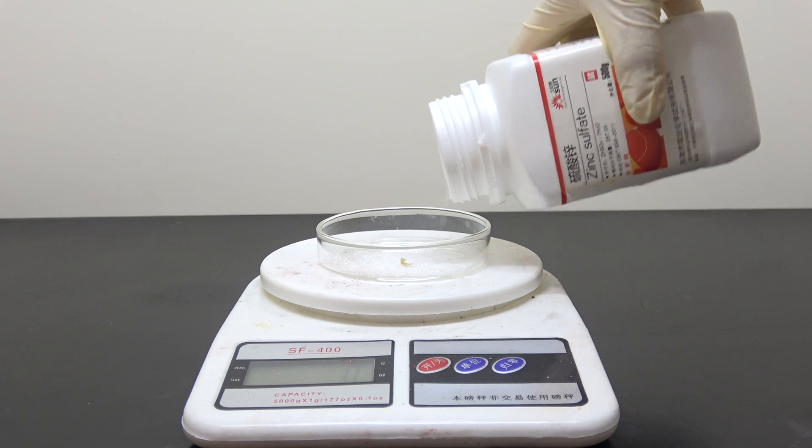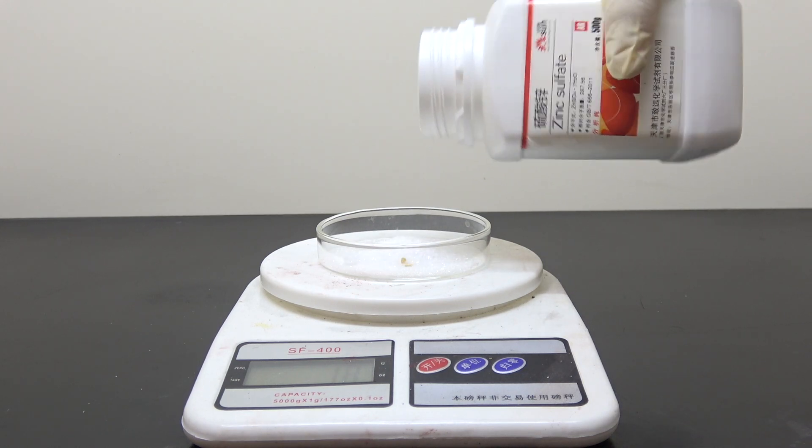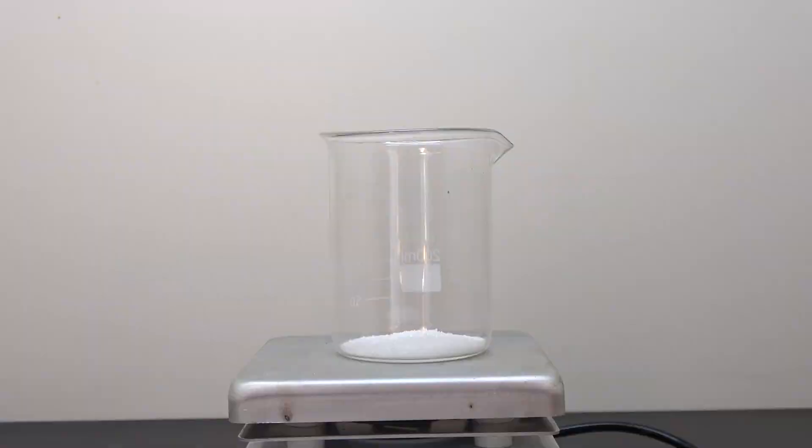In order to do that, first we need 10 grams of zinc sulfate, which is then dissolved in 50 ml of distilled water.